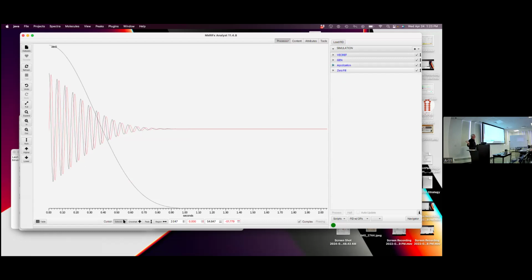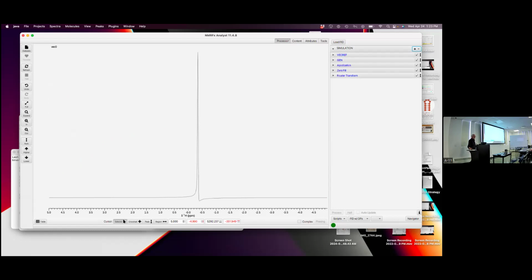So, okay, next thing, Fourier transform. Why do we do that? If you look at this signal, I could figure out the frequency of this time domain signal pretty easily. I could actually get my ruler out and measure between the waves and figure it out. As soon as I start adding more signals in there, it gets so complicated that I can't distinguish different frequencies easily. So if we go into the Fourier transform, we move the data into a domain where we can actually pick out frequencies. Let's go back to our plus button, common operations, insert Fourier transform.